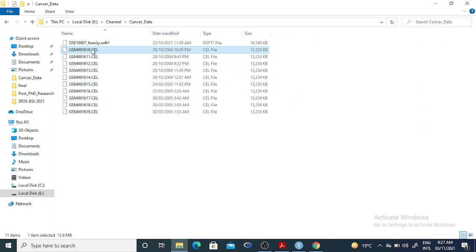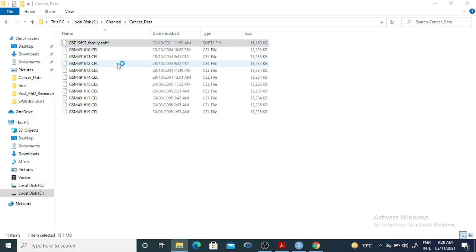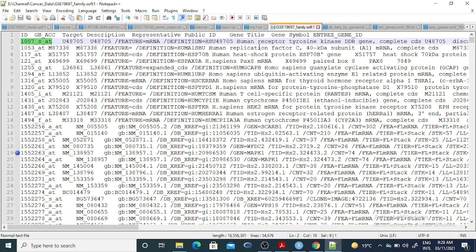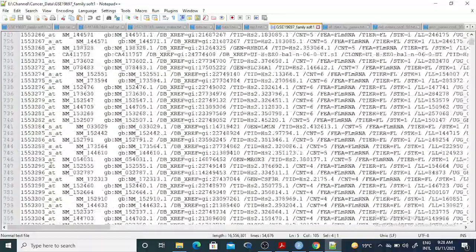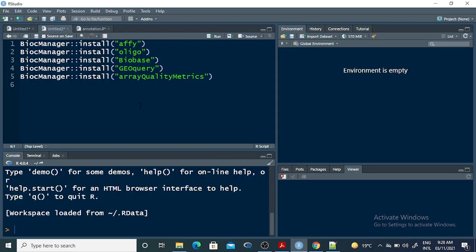I've saved the data in my computer. This is the soft file which I will be using for annotation, downloaded from GEO. I've modified this soft file — it mainly contains all the annotation information. Before performing the analysis, you have to exclude the extra description columns at the beginning and start from where the probe IDs begin, keeping the header. For example, this is the probe ID for the DDR1 gene, and this is the probe ID for the PAX8 gene — so you have annotation for all probes.